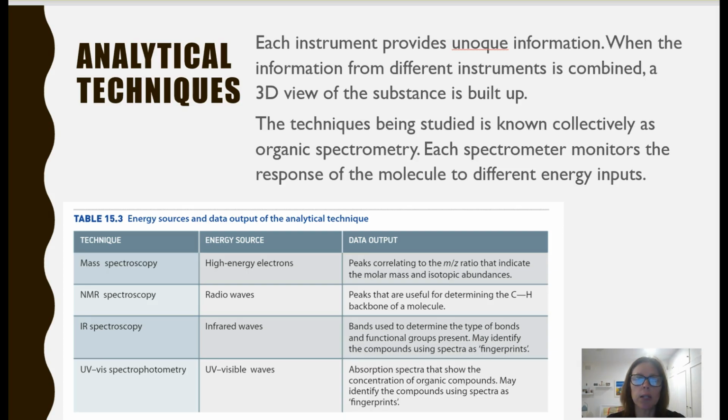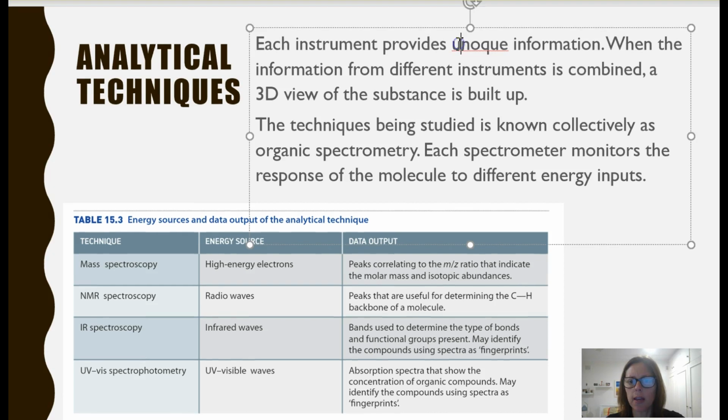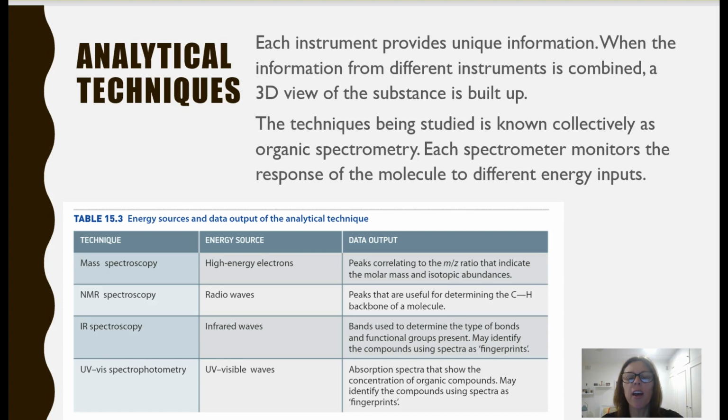So what techniques are we going to have? And already I can see here there's a mistake in our video. So each instrument that we actually use, and you've already seen some of those in our visit to the TAFE, each of them will provide different information, and no one of them provides a perfect picture, and so often they are used together to give a really big sort of holistic view of the substance that we might have.